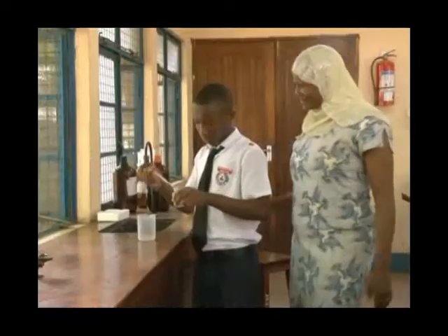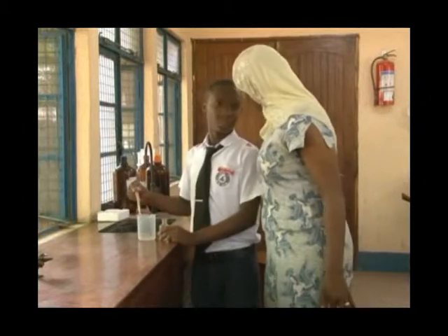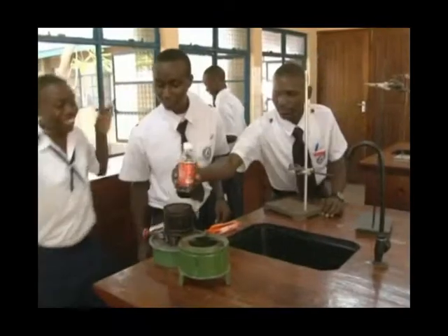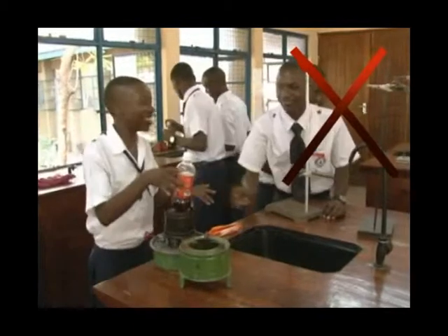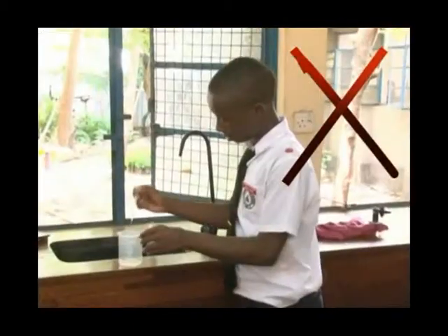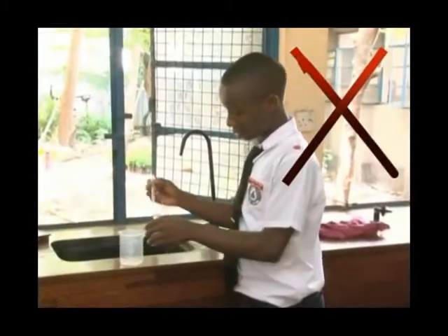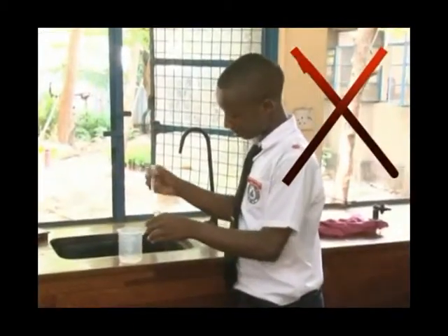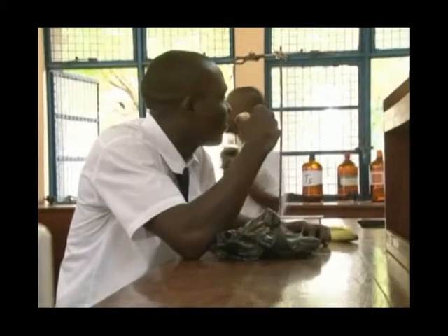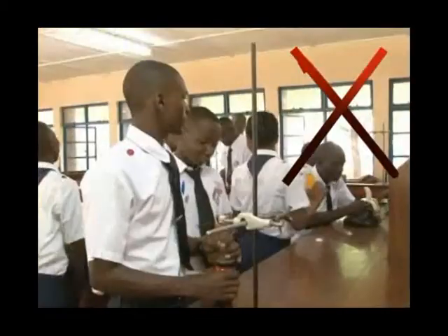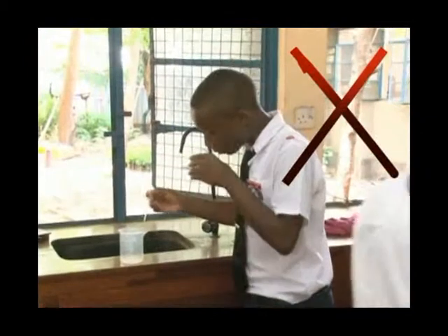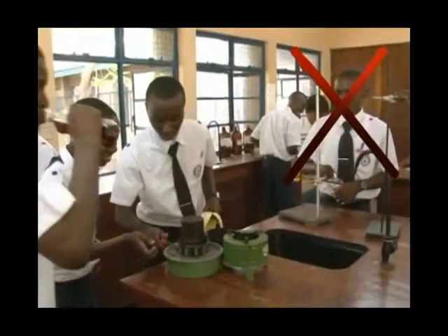Rule number one: learners should never handle any chemicals or laboratory equipment without permission. Rule number two: never eat, drink, or taste anything in the laboratory.